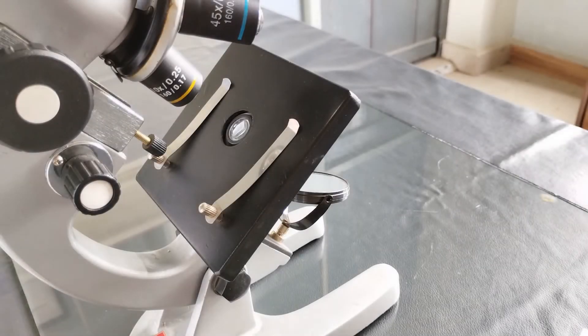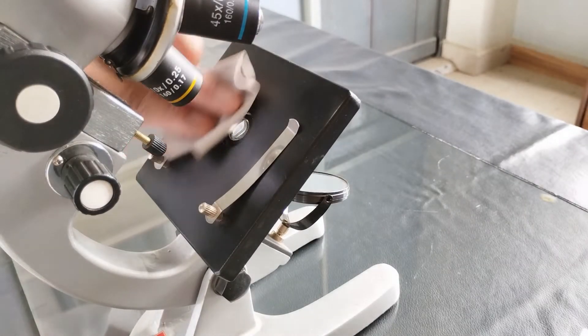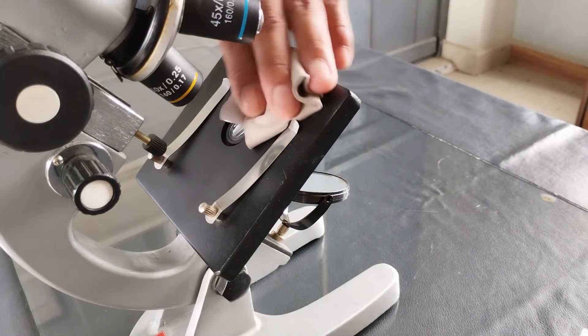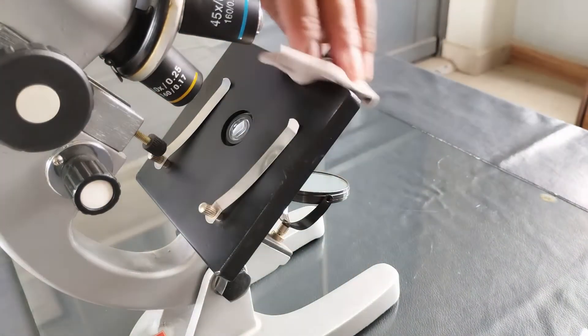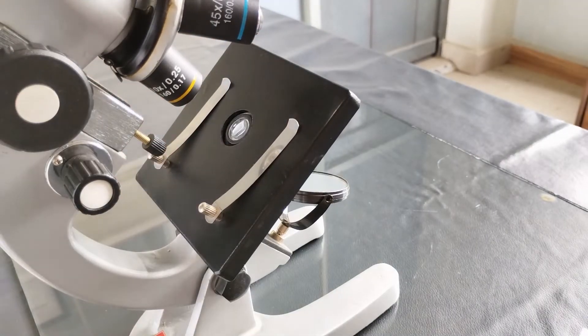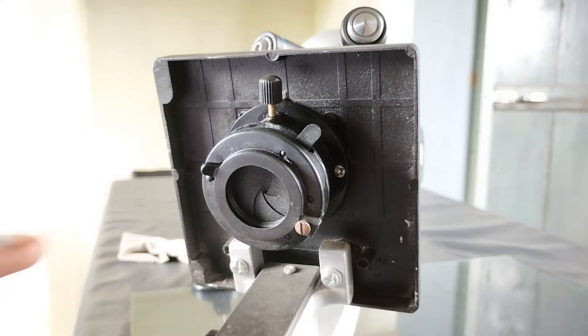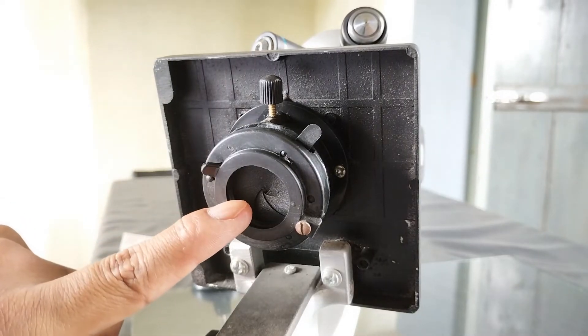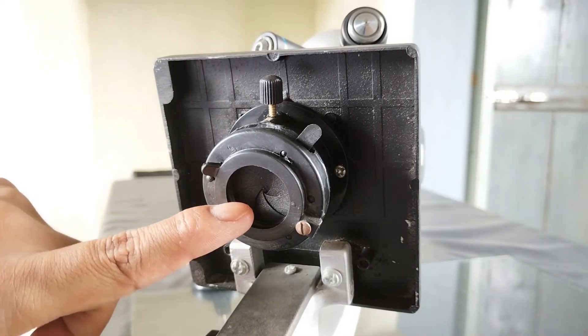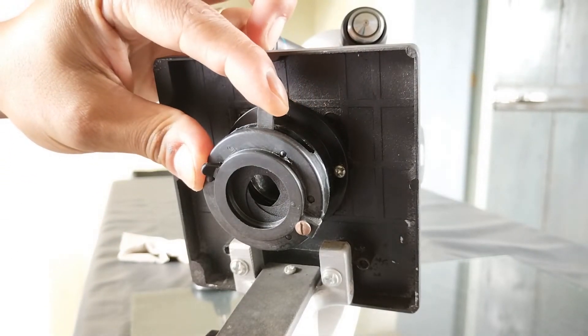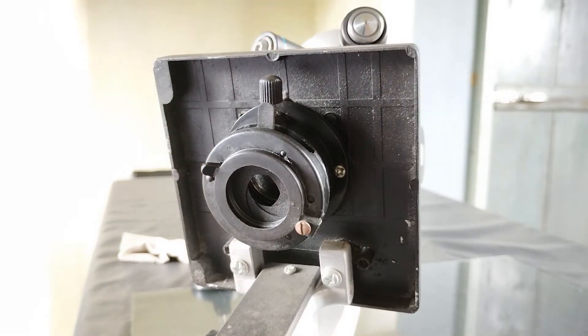Wipe the specimen stage with lint-free tissue or cloth to remove dust and debris. If the microscope comes with a condenser, check the iris diaphragm. Make sure it's at least partially open. If fully closed, adjust the aperture using the diaphragm adjuster that sticks out from the condenser body. Also, make sure the condenser lenses are free from dust and dirt.